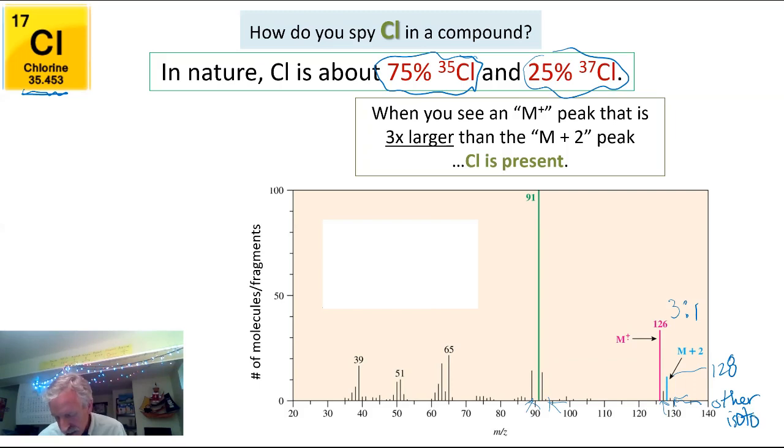Carbon 13 had to make an appearance in 1% of the molecules sometimes. So it's going to show up as little teeny peaks around your major abundant peaks that are all made with carbon 12 and H1. And in this case, chlorine 35 and chlorine 37.